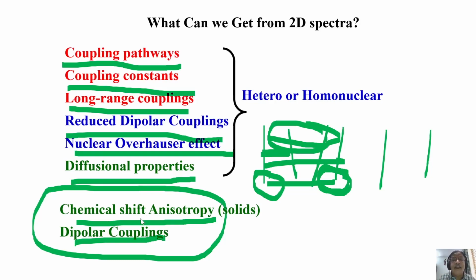You will not get it in the solution state. However, it is present in the solid state. We can get this type of information when I do solid state NMR. That includes dipolar couplings; further, we can get only homonuclear dipolar couplings, or only heteronuclear dipolar couplings.